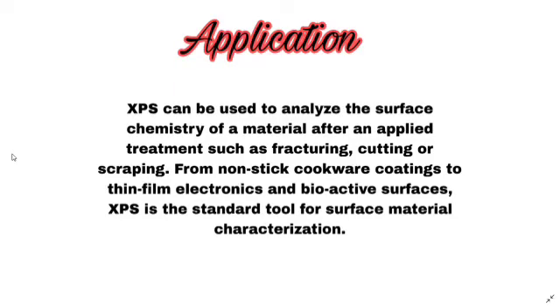Now the application. XPS can be used to analyze the surface chemistry of a material after an applied treatment such as fracturing, cutting or scraping, from non-stick cookware coatings to thin film electronics and bioactive surfaces. XPS is the standard tool for surface material characterization.